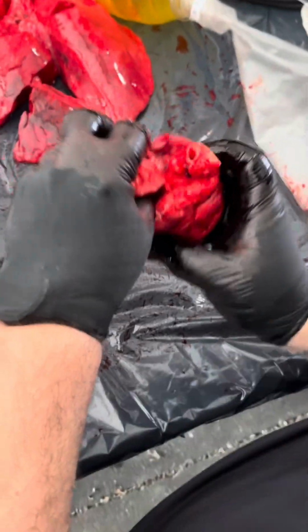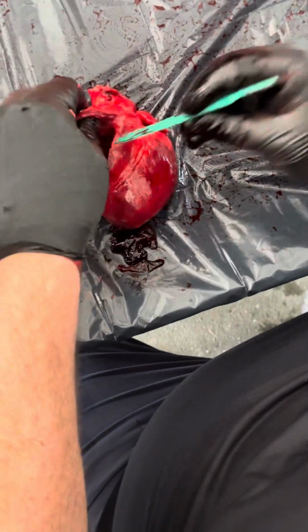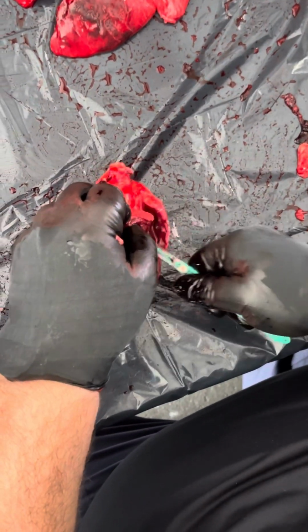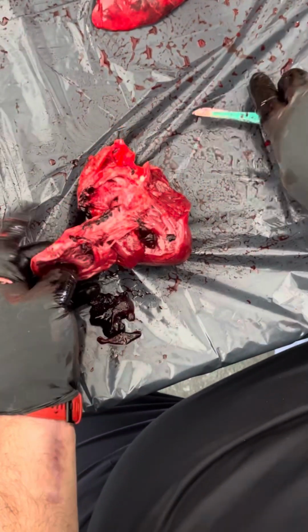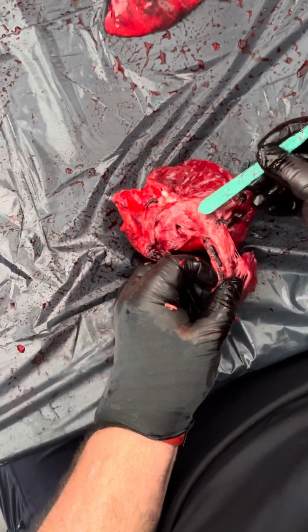If you look at it from the top, you can see these chordae tendineae are holding all of these leaflets. That leaflet is the valve. All of these leaflets are your valve.